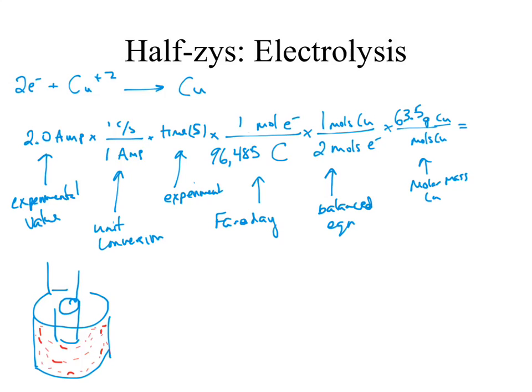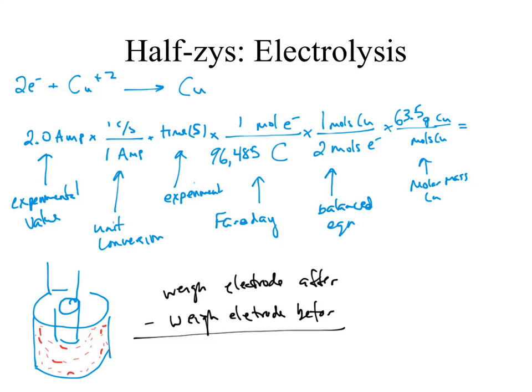Okay? So what we can do is weigh the electrode before and weigh the electrode after. The difference between those is the copper that was in the solution.